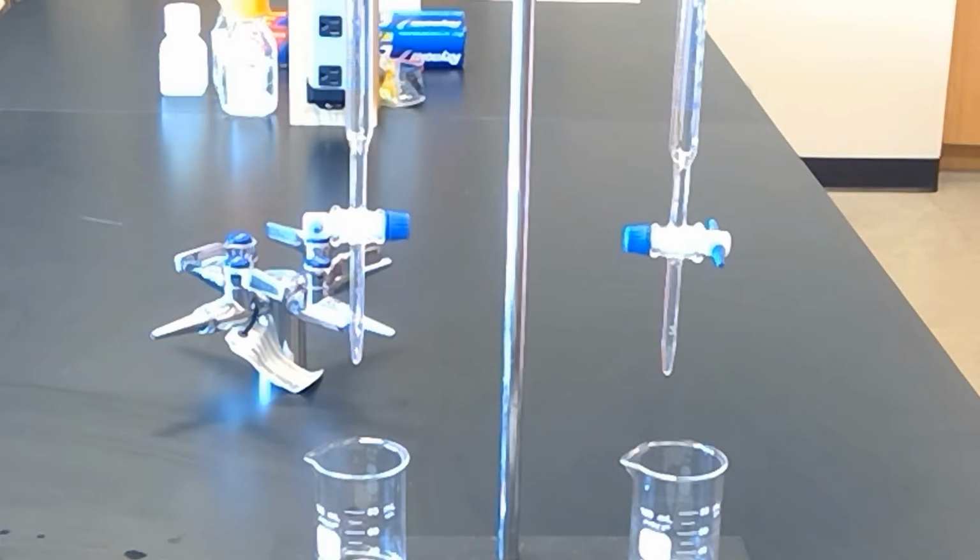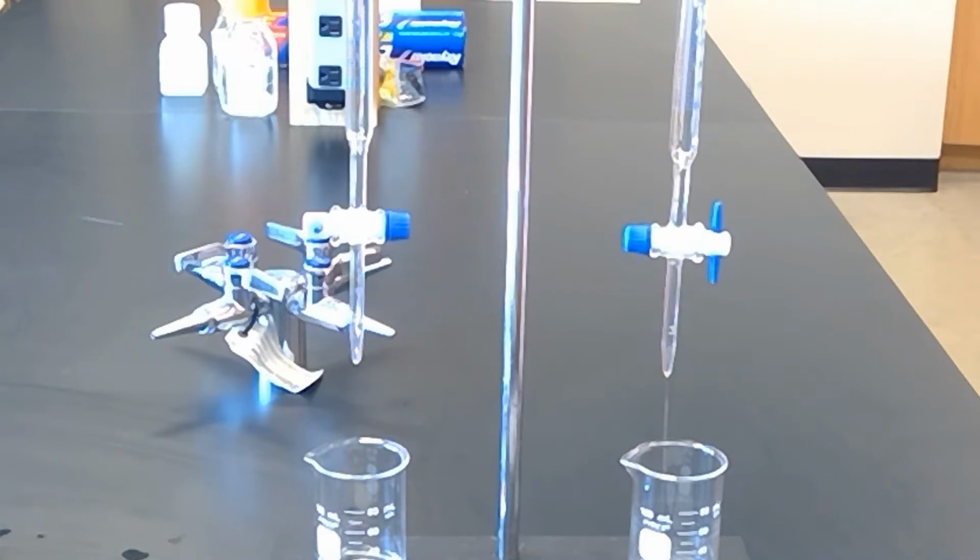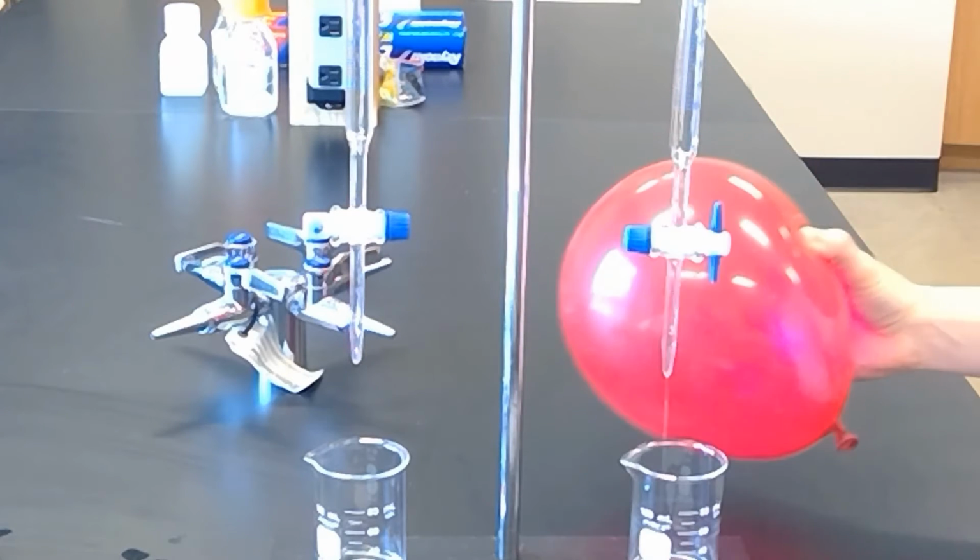And then finally we have hexane in our last burette. And hexane is part of the alkane group, which is sometimes called no functional group and also has more of a gasoline type smell. So if we turn that on, we have a normal stream. Charge my balloon one last time.